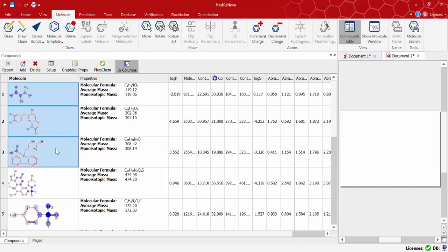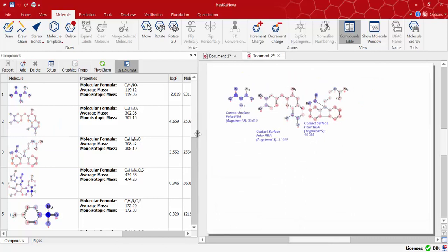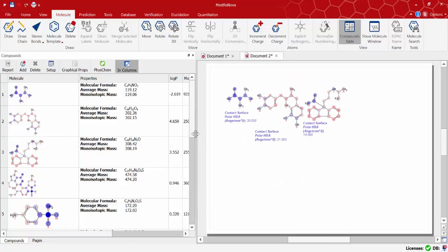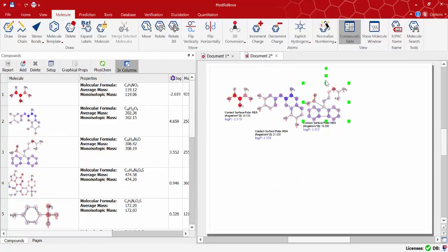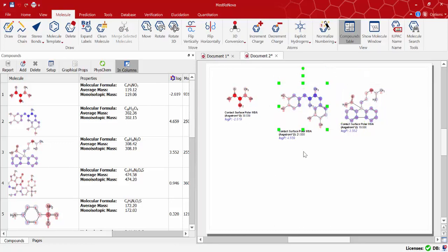If for instance we select three molecules we can report these three on the main window. Then we can resize and refit them around the screen as we wish.